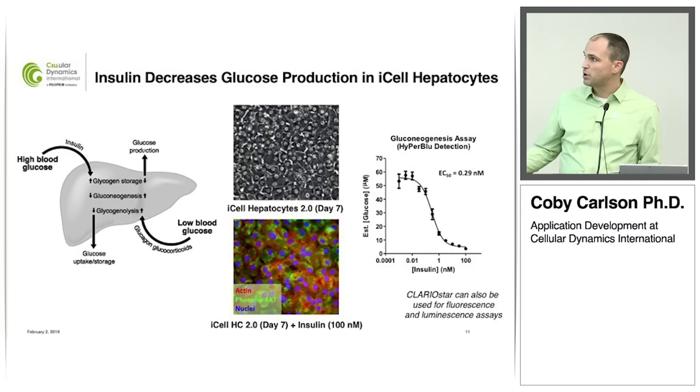And so an important part of this, although, like I said, we're talking about HTRF assays here, is that we have to show functionality in a lot of different ways, and we think that the HTRF format is really complementary to what we want to do, and that's what we're trying to help show. But this is just a standard luminescence assay in this case, again underscoring how the Clariostar can be used for a lot of different endpoint readouts.